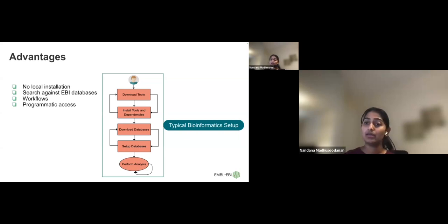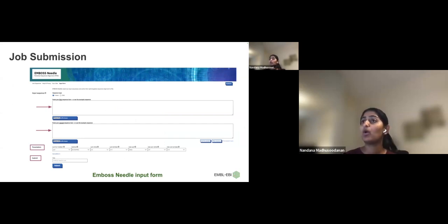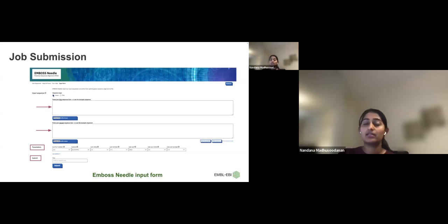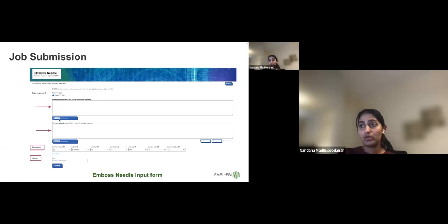We also provide programmatic access in addition to the web interface — I'll talk about that shortly. This is a typical Job Dispatcher tool homepage. This is the input form for EMBOSS Needle. Most tool templates look the same: there's a description about the tool, you can select sequence type (protein or DNA) and the parameters change accordingly. Since it's a pairwise alignment, it expects two sequences. You can also use the file upload option, and example inputs are available linking to our documentation page.